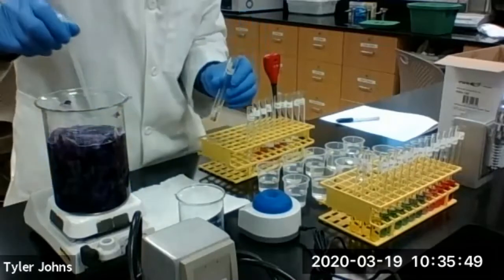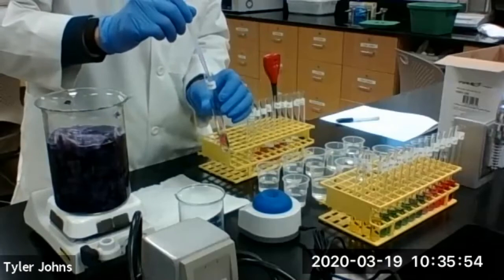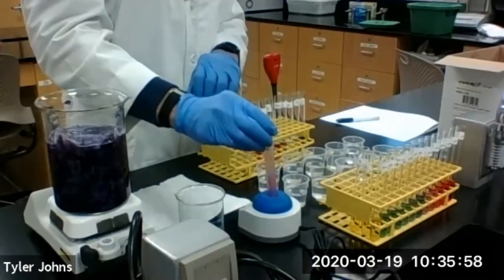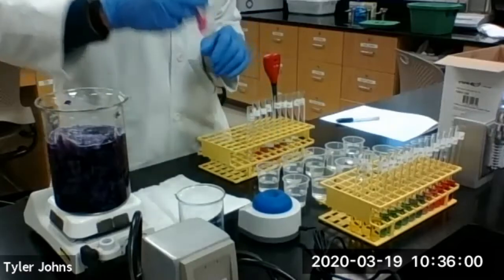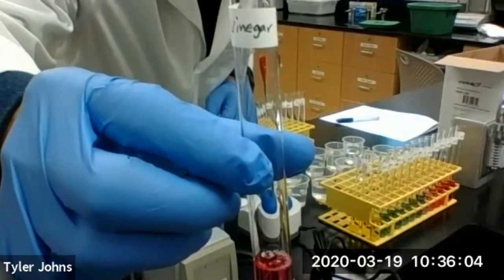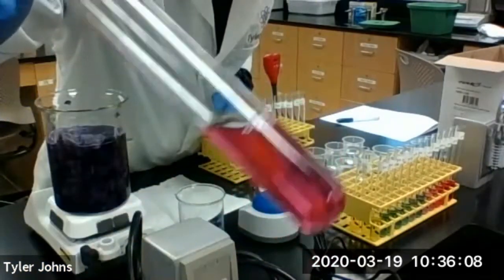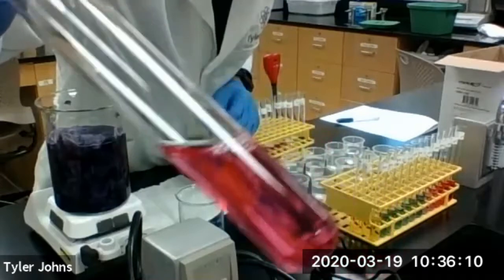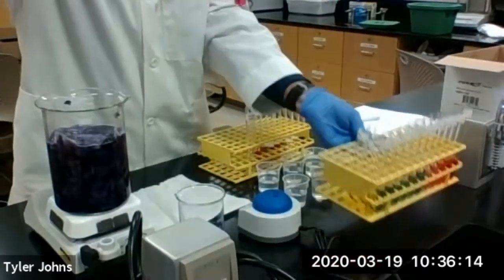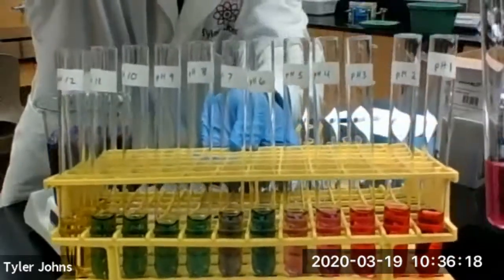All right, the next household solution we'll be testing is vinegar. We have our vinegar. All right, compare our vinegar to our standard references.